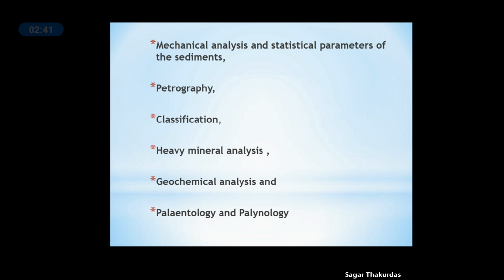From that you have to separate these microfossils, then observe them after mounting them on a slide. And after observation you have to do the identification that can help you in finding the age of the rock and many other factors. Palynology involves the study of pollens and spores, and these can again be studied on the same lines as microfossils, which can give us great data related to the paleo environment.